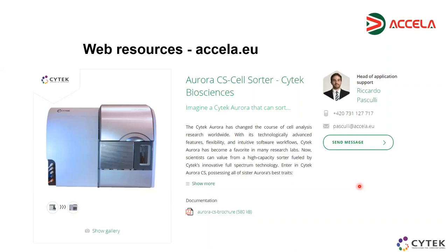Let's try not to misunderstand. I said that we need 200 positive events for the unmixing. So not 200 cells to sort. It's a little bit different. Our algorithm will ask you, if you say that this is your single positive control, to gate at least 200 positive cells to be able to make the correction. So 200 events, let's call it, because cells maybe is not correct. 200 positive events. Yes, the optic is exactly the same.